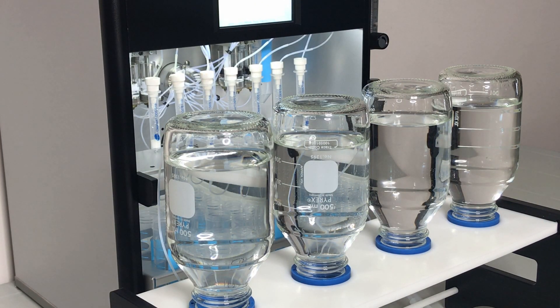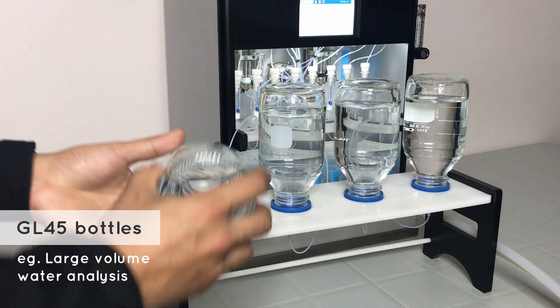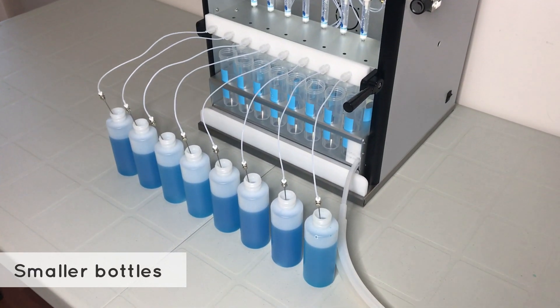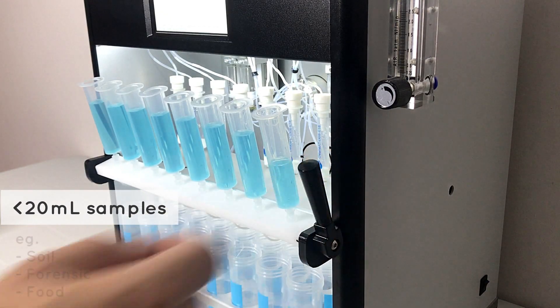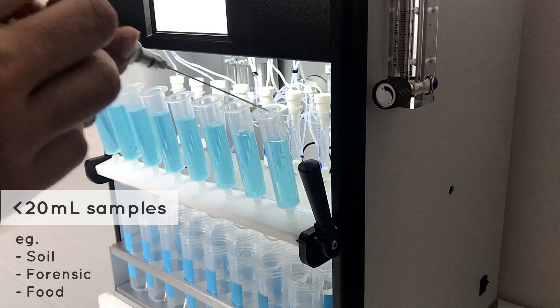It works with a wide range of sample sizes, including GL45 containers which can be mounted on our optional bottle rack, smaller sample bottles, and various other containers. Smaller volume samples such as soil, forensic, and food samples can be directly added to our provided sample tubes.